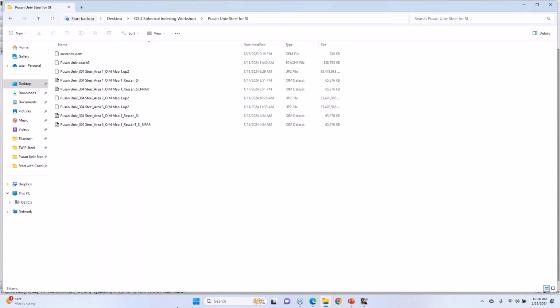It will struggle. So we like a single pattern file. We do have the option to save patterns into an H5 file directly, but if you start having multiple ones of those, they get really large and cumbersome. Depending on the data set, I like to carry the data set separate from the pattern file, so I have the option of associating a different pattern file and have some flexibility. But those are the main file formats that we use. Does that help?